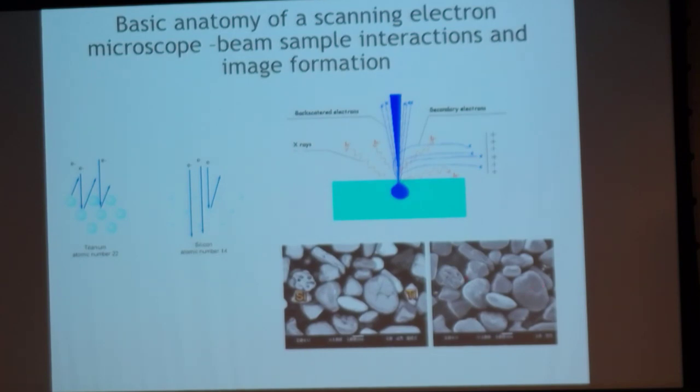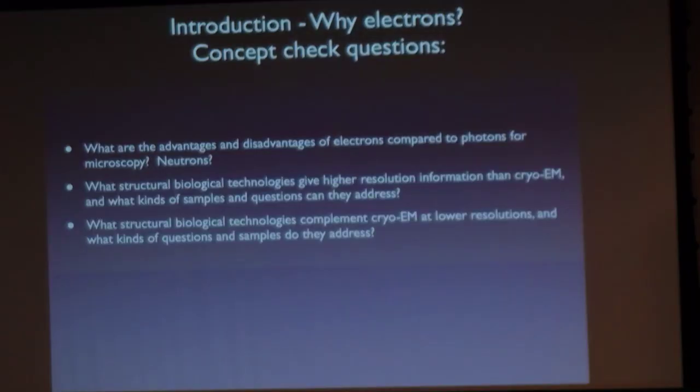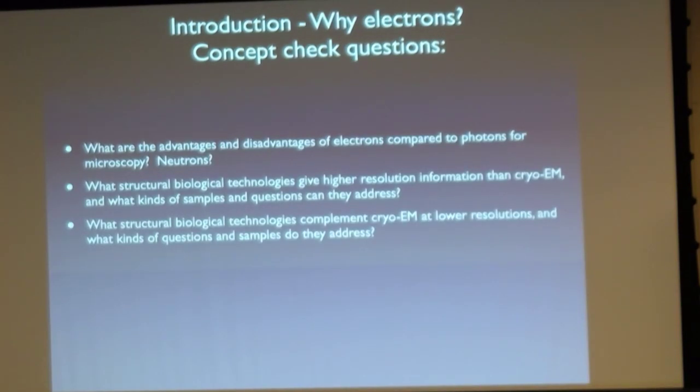That makes it unique in its behavior. If you use TEM, you won't see that unless you have an energy filter or do something else to it to look at the secondary electrons. And that's it, actually. That's all I want to cover.